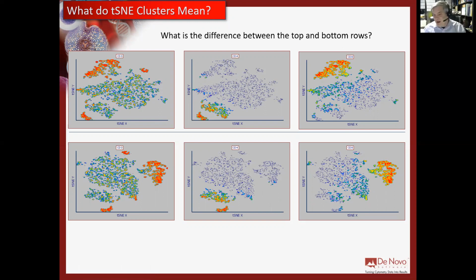So if you think about what an algorithm does, it does a mathematical calculation starting somewhere. Right. And that could be, when you run a cytometer, event number one that goes past the laser. It can be event number 5,000 that goes past the laser. Right. So in the top plot, we told it to start at, say, event number one. At the bottom, we told it to start at event number two. So our distributions are different, right? Or if we had different data files, if they have different numbers of events and events with different values, the distributions will look different depending on where you start or what kind of data file you start on.